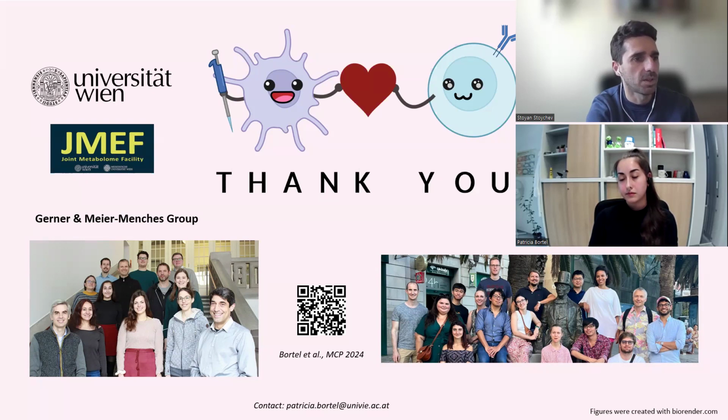Yeah, and I think this will be the case also for different types of sample inputs. In this case, you work with cells. I'm not sure if you've started to work with other sample sources like tissues, but these will definitely have an effect on the enrichment efficiency. And so the front end, the digest preparation, becomes really critical in this respect.